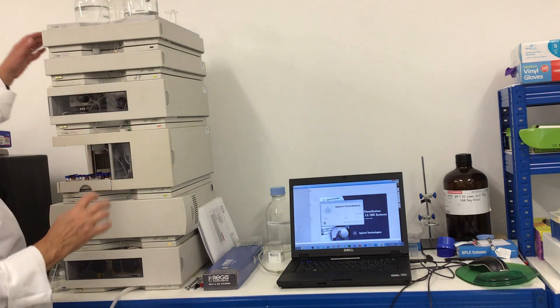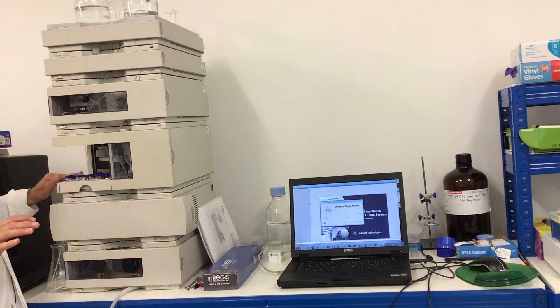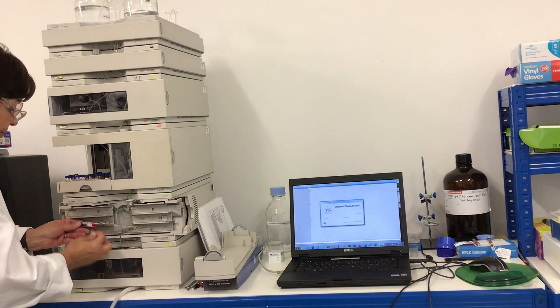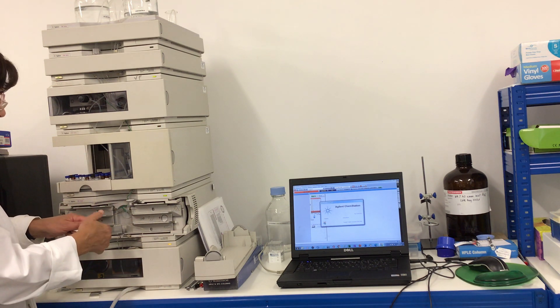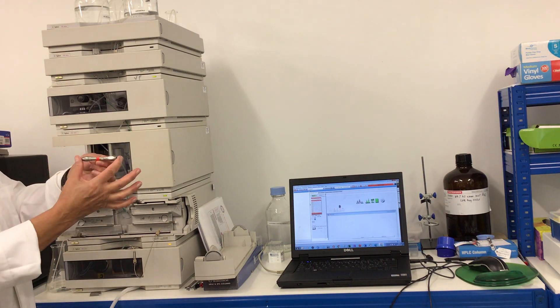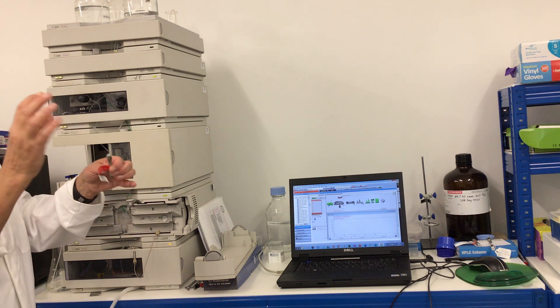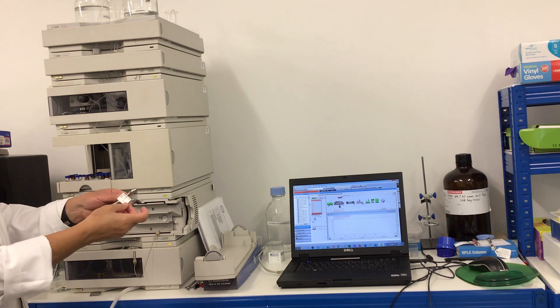Now you can see my autosampler module — the robot is adjusting itself. Here are my samples, and here is my column, the heart of the HPLC instrumentation. I'll remove it now to show you how to connect a column while the software is firing up. This is where the separation will take place. This is a reverse phase column — a Gemini small column where I usually run a fast gradient analysis from 0 to 100% acetonitrile mobile phase to analyze the lipophilicity of compounds.